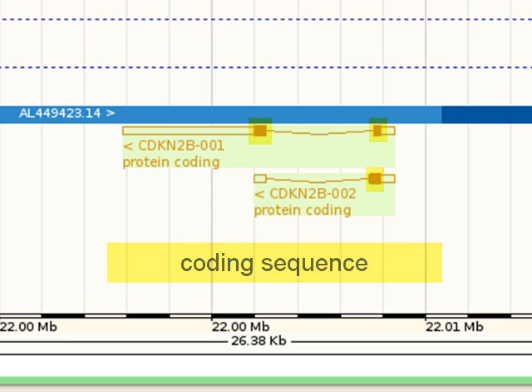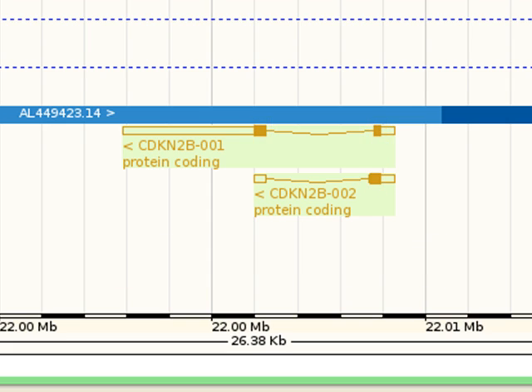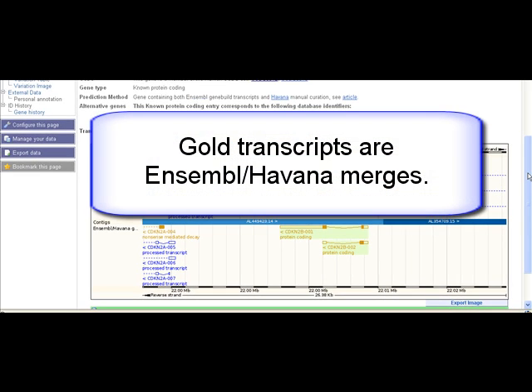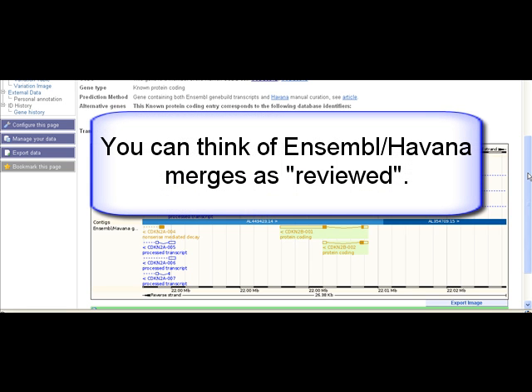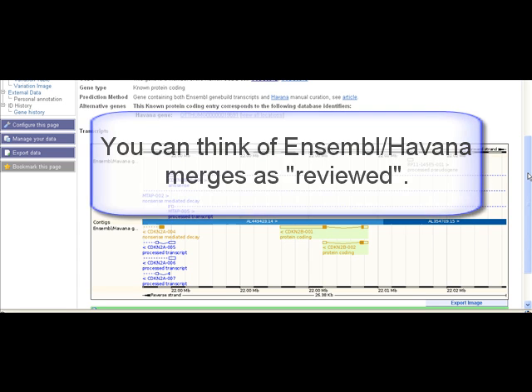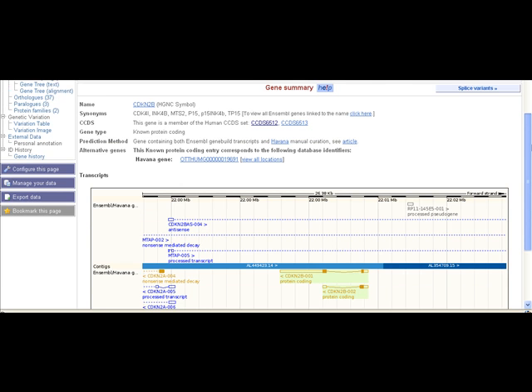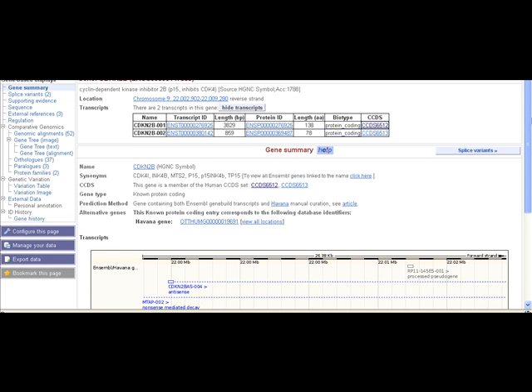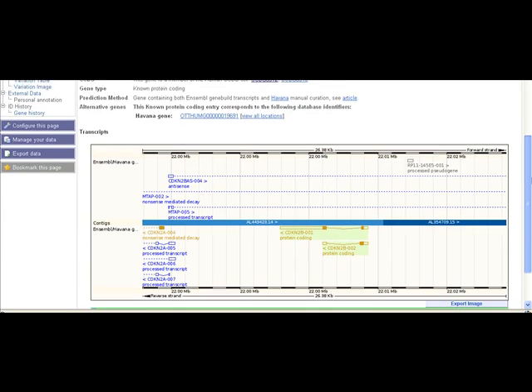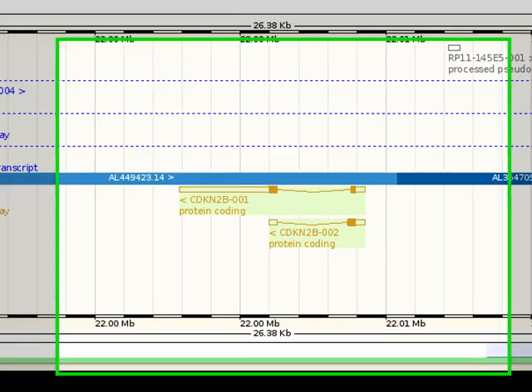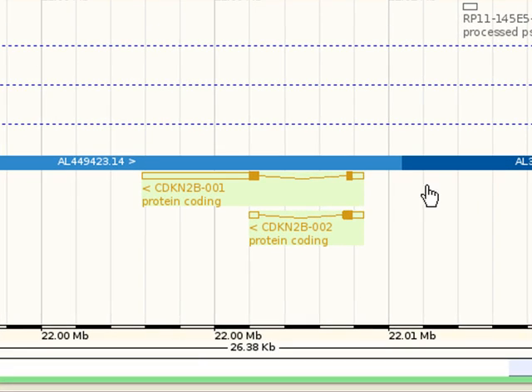Both transcripts are described as being Ensembl-Havana merges. This means the same transcript was found by the Ensembl automatic annotation pipeline and the manual curation by the Havana project. Ensembl-Havana merges are colored in gold. Let's choose one of the transcripts to explore further — we can either click on a transcript ID from the table or click on a transcript diagram and follow the link to the ENST identifier. I'll choose the longer transcript.